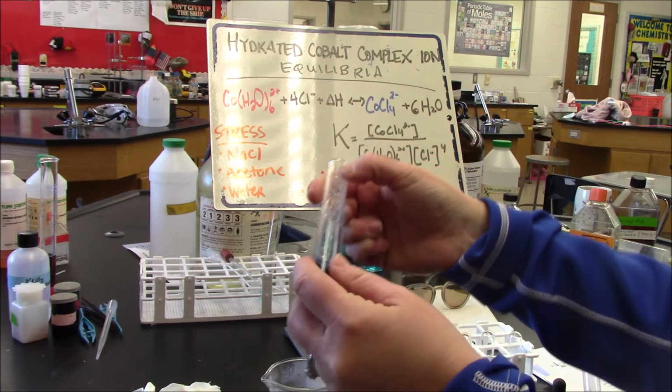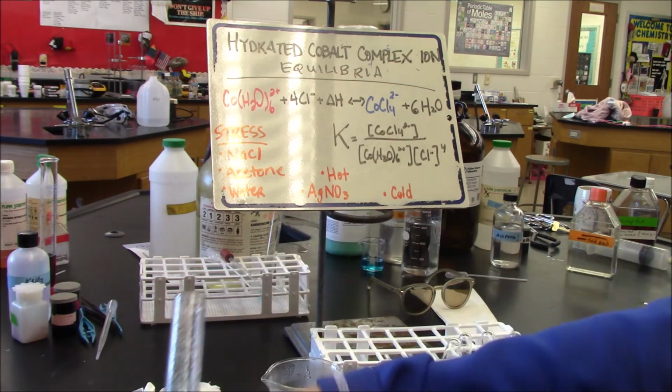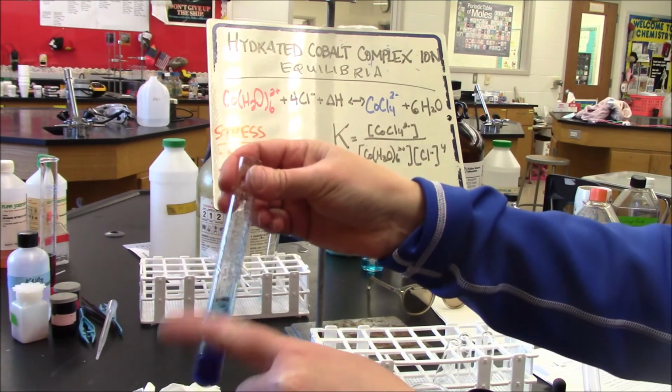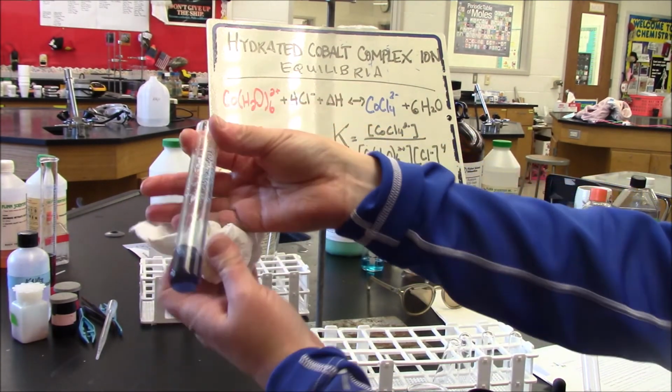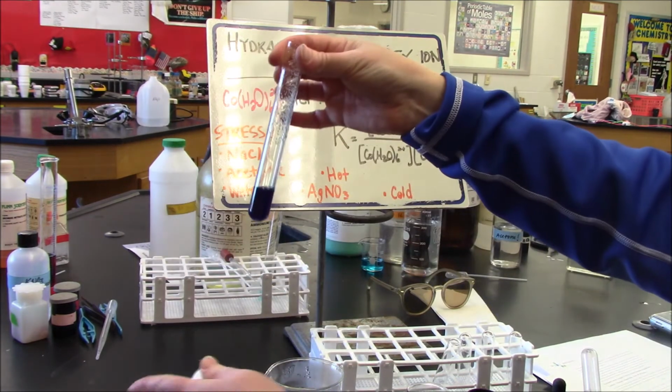And as you can see, the blue color just intensifies, as I have my complex ion between cobalt and chlorine.